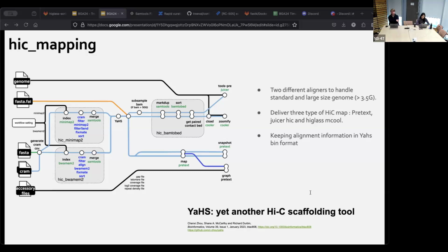Next, we align the batch containers and filter unwanted noise. Once that's done, we use samtools fixmate to make sure the mate information for paired reads is properly set for both reads as a pair. In the final step, we merge everything using samtools merge. As you can see, samtools plays a major role here, thanks to Hughley.